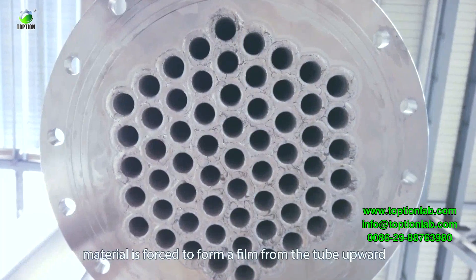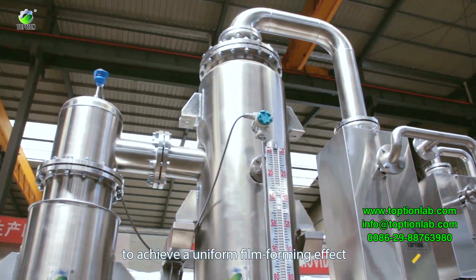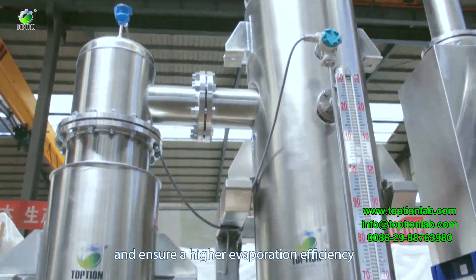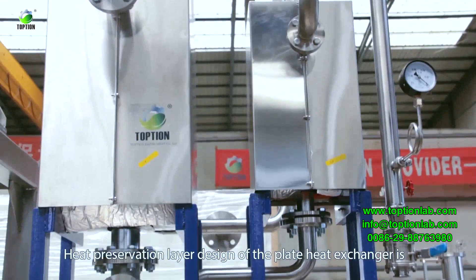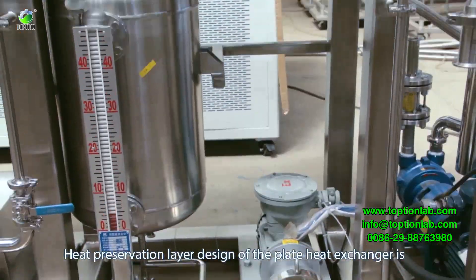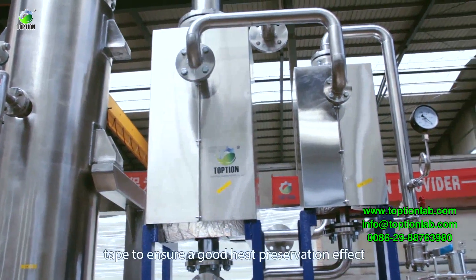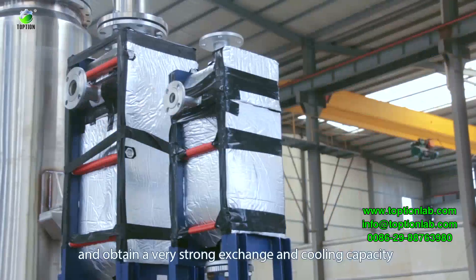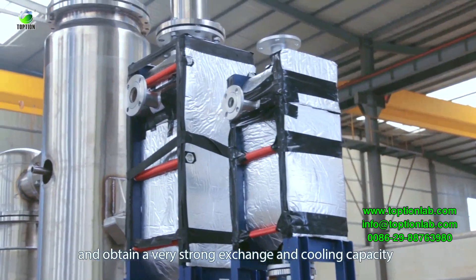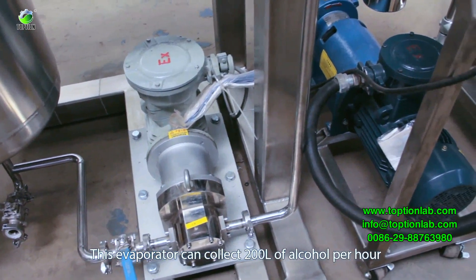The evaporator has a built-in tube. Material is forced to form a film from the tube upward to achieve a uniform film-forming effect and ensure higher evaporation efficiency. The plate heat exchanger's heat preservation layer is completely wrapped with aluminum foil, insulation cotton, and tape to ensure good heat preservation and strong exchange and cooling capacity. This evaporator can collect 200 liters of alcohol per hour.